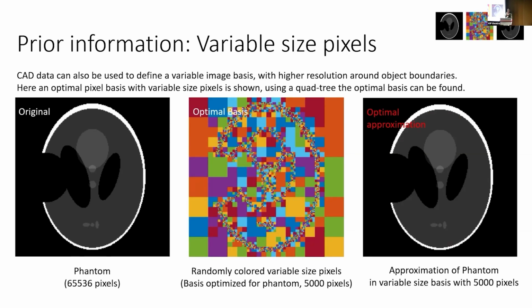All right, so talking about voxel-based bases, the other thing that we can do is instead of prefixing regions, we can have a basis where we still have voxels, but the voxels are different sizes. So we can start with a big voxel, which we then break in 3D into 8 smaller voxels and so on.